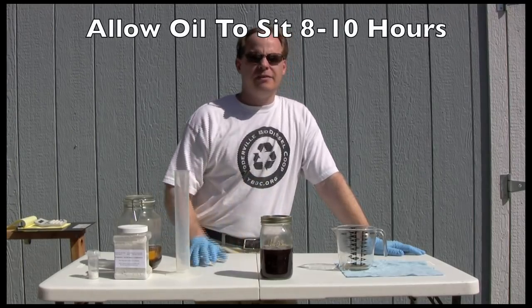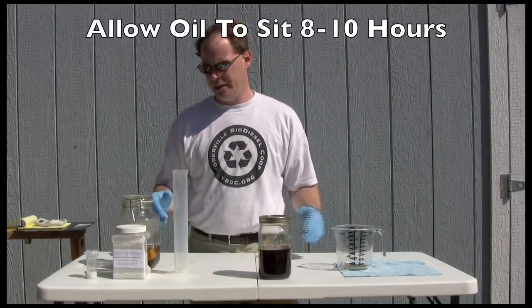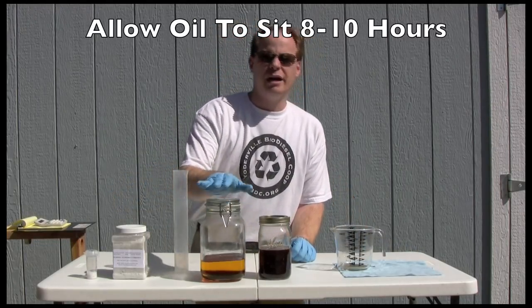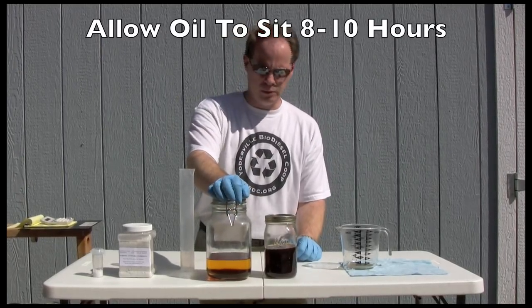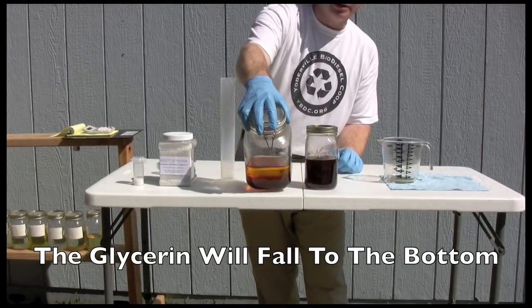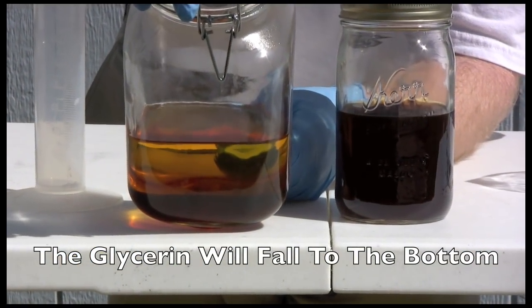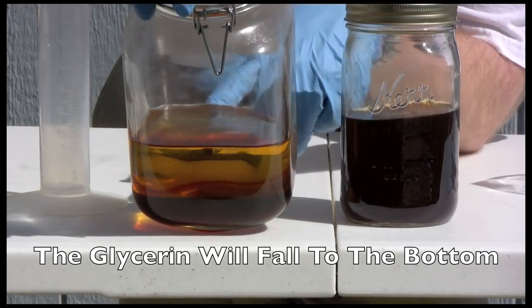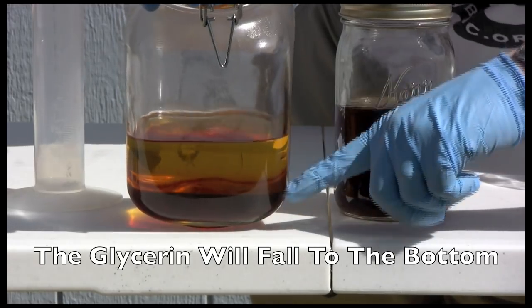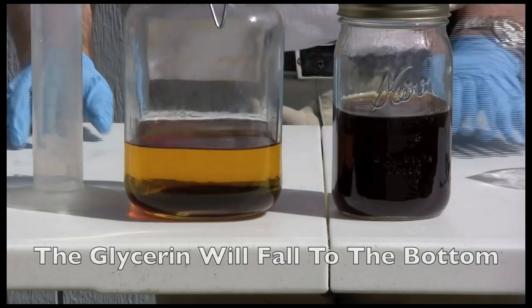We've now shaken this for about five minutes and you'll notice that the color has just gone dark, dark, dark. That means the chemical reaction has gone on. This is biodiesel that was made from waste vegetable oil as well. If you look close, you can actually see the separation layer that happened in this biodiesel. What you do is let it sit for about eight to ten hours and the glycerin will settle out off the bottom. You'll get this beautiful separation layer between the two — the stuff on top is biodiesel and the stuff on the bottom is your glycerin.